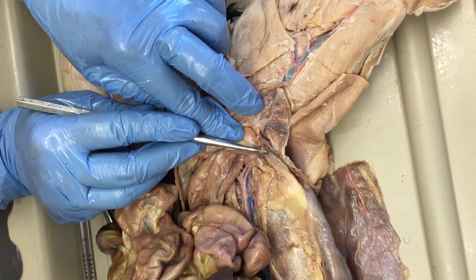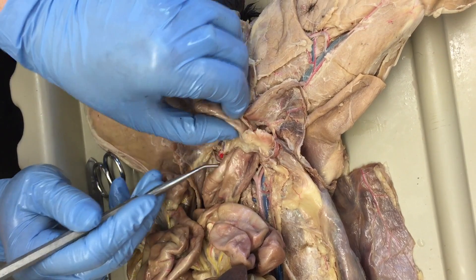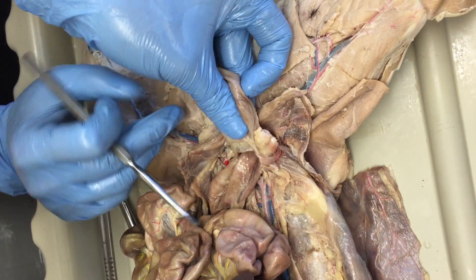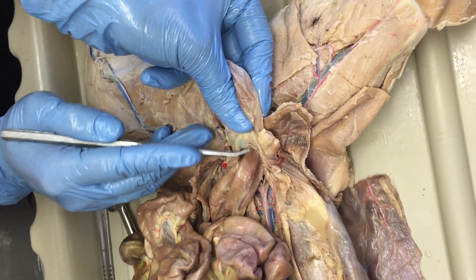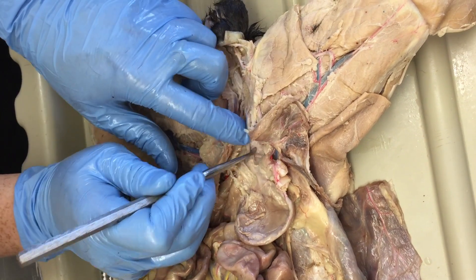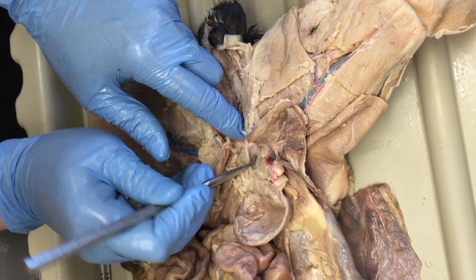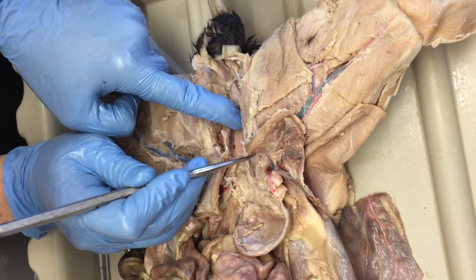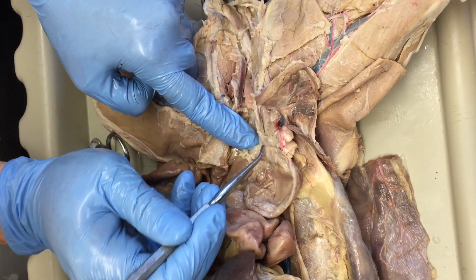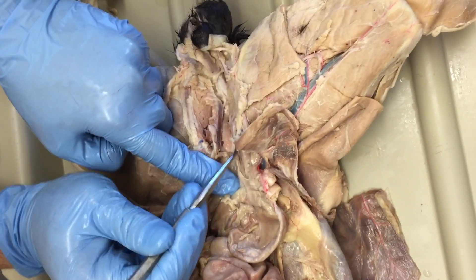That's your ductus deferens. You've got one on each side, and they come together and meet behind the bladder, making kind of a T-shape back here. They run down behind the bladder and then come together to meet the urethra at the prostate gland. The bladder leads to the urethra down here, and they all meet at the prostate gland — that's how the sperm gets where it's going.